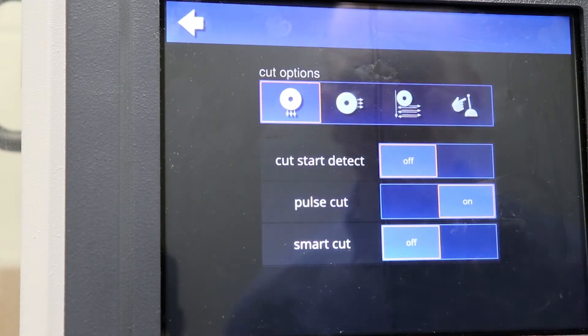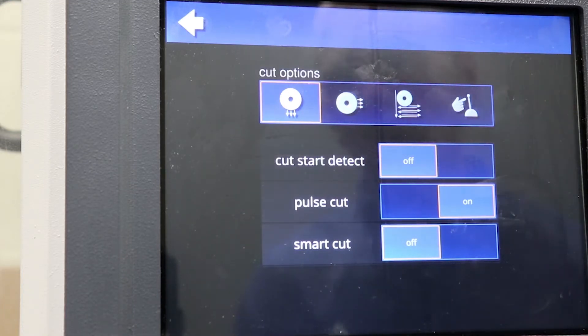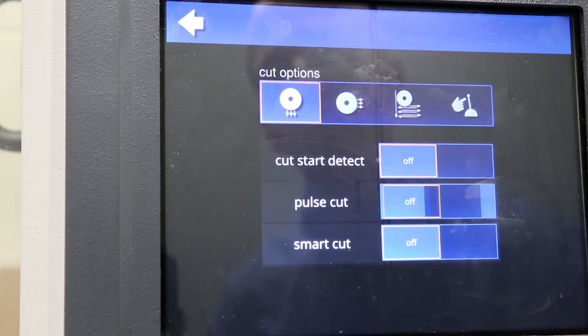Pulse Cut is a feature commonly found on Buehler saws. Pulse Cut momentarily stops the advance of the blade during the cut in order to allow coolant to cool the sample and limit thermal damage to very difficult-to-cut materials.